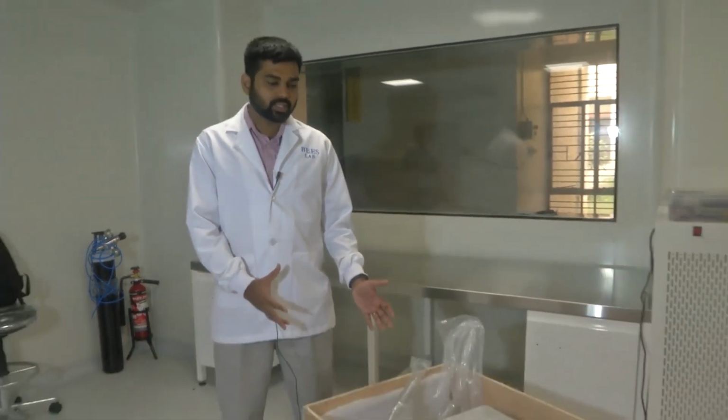Hi everyone, welcome to this module. Today it is a very interesting module. We have planned to show you installation of a very useful equipment that is used in a clean room. We have just opened the carton for the oxygen plasma system here.